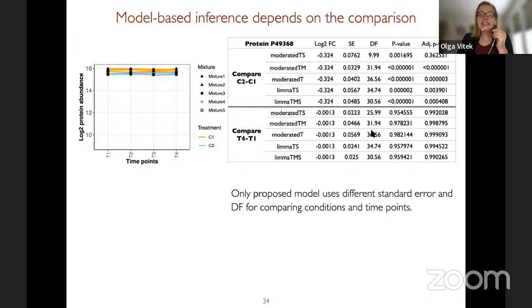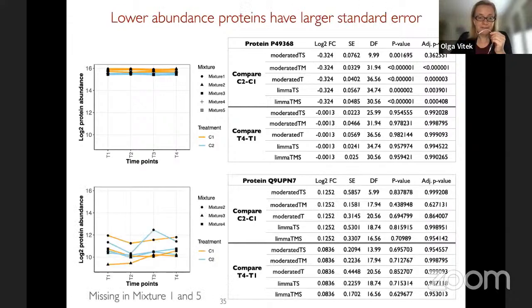It's another indication that the within subject and between subject variation is not distinguished appropriately. And this is just to show that when the features are more variable, we will of course have larger p-values, and when the features are more consistent, we have smaller p-values.